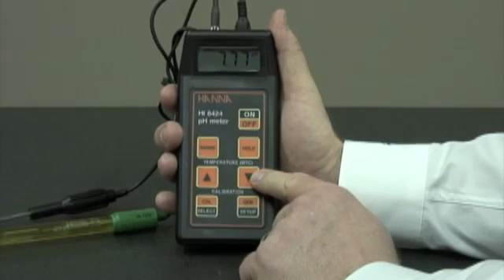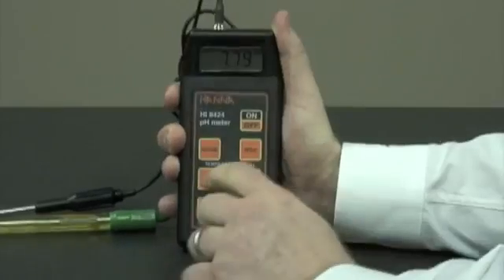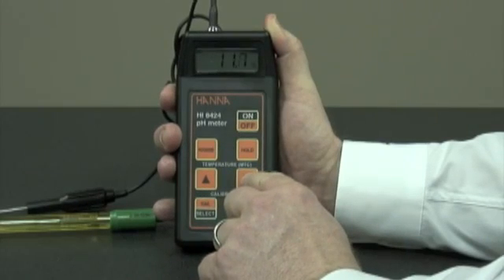Temperature buttons: right now, with the temperature probe in, we have automatic temperature compensation. If we took the temperature probe out, we could use these buttons for manual temperature compensation and adjust it manually.